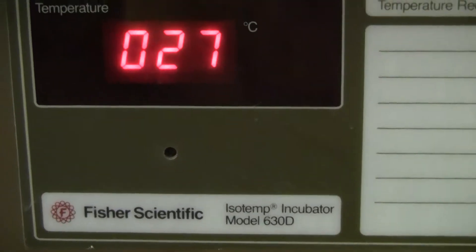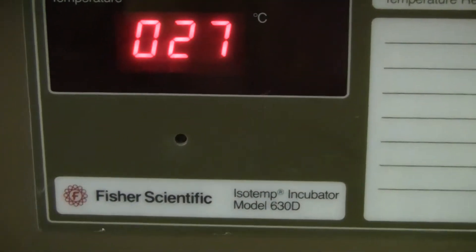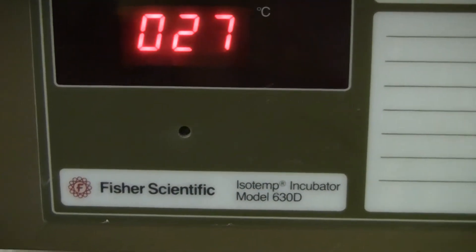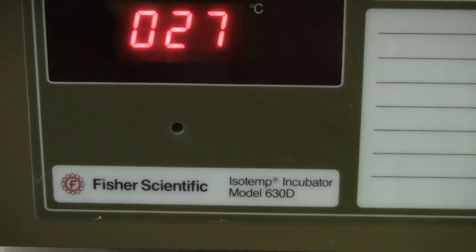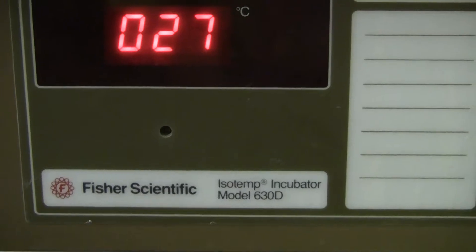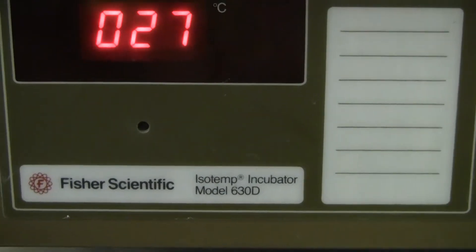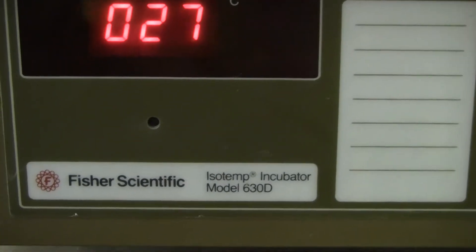Hi, this is Michael Natow from Hi-Tech Trader. Today we're looking at a Fischer Isotemp Incubator, model 630D.